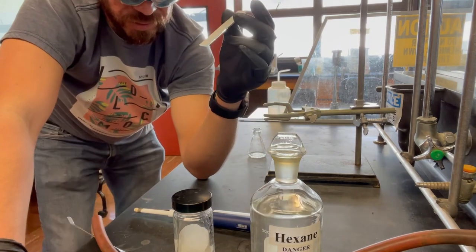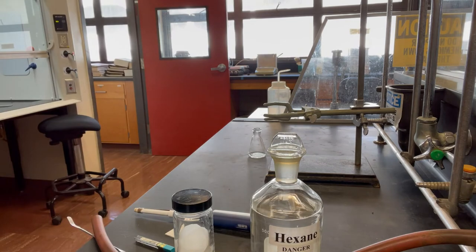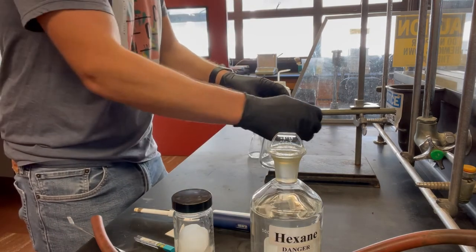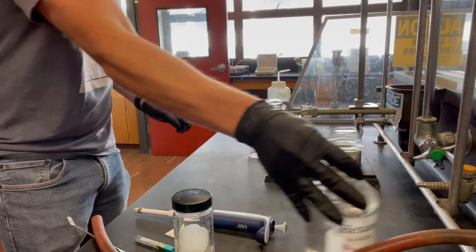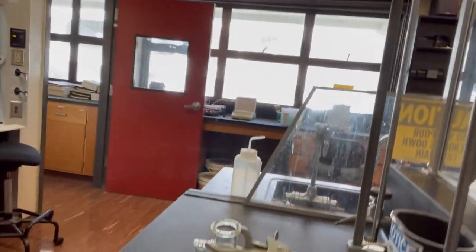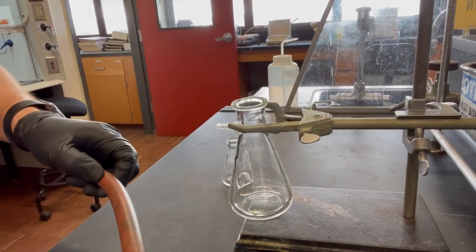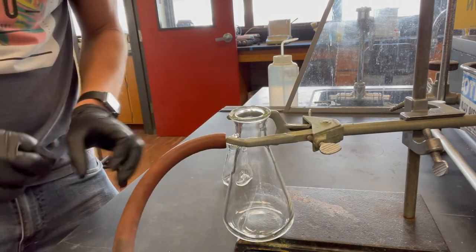But yeah, let's go ahead and do the thing. Thought I had a filter flask for y'all. Let's go ahead. Connect it here. Bada bing. Bada boom. You can't see that. All right. Let me move this closer for you guys. Check that out. I actually remembered my tripod today. It's pretty neat, huh?